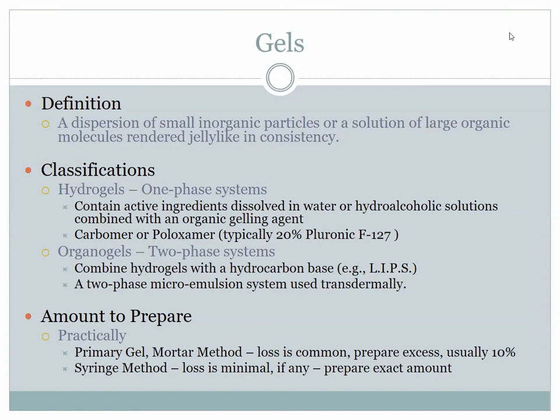Now, why did we choose to use pluronic or Poloxamer instead of carbomer? Poloxamer is more awesomer. That's why, and I even recorded that word. Why is it awesome? Because it's a liquid already. The carbomer comes as a solid, and to deal with carbomer, you have to heat the water really hot, and then you have to sift it in slowly because carbomer is kind of like a wax, so you have to melt the wax, but you don't want it to clump together, and it takes forever.